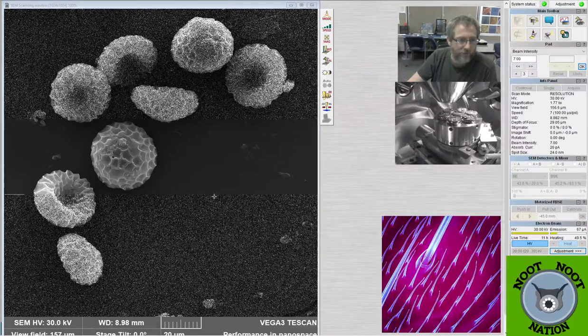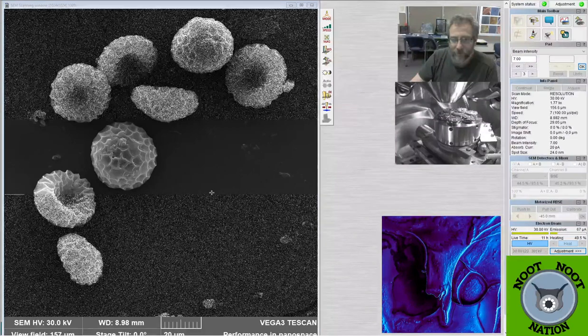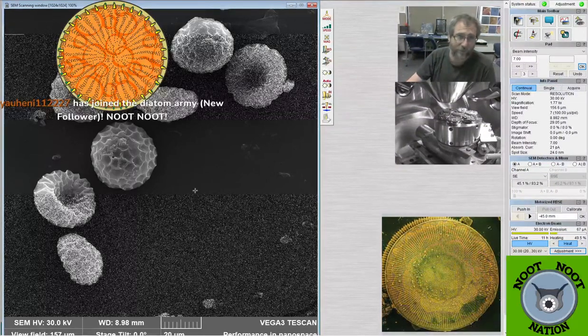Just adjusting the brightness a little bit. And then I'm going to snap an image of this phlox pollen, which is pretty cool. I was wandering around campus just sort of plucking flowers when no one was looking. I think the phlox was growing there on purpose. I think somebody planted it, but there's a lot of phlox that just grows around. I think it spreads pretty quickly around here. So I find it whenever I go out into fields, sometimes just growing, not in places that get mowed, but growing natively, pretty common.